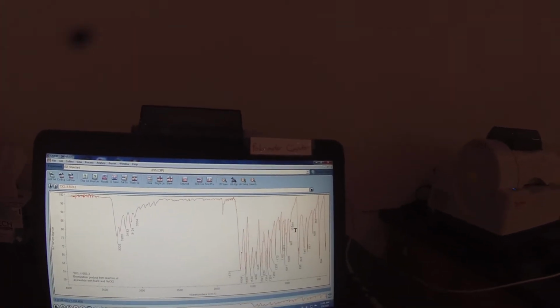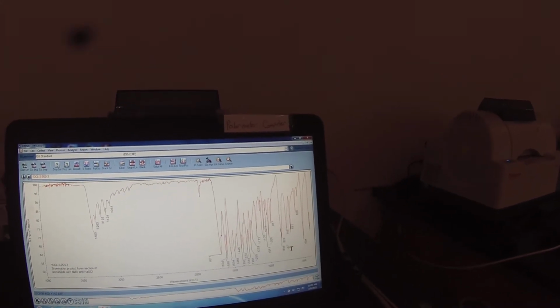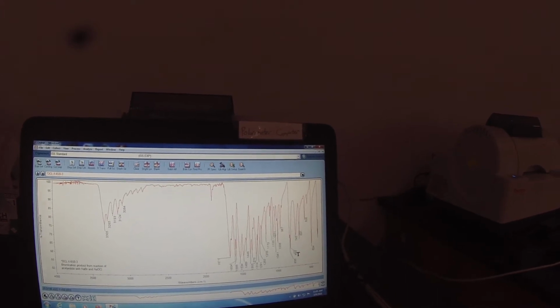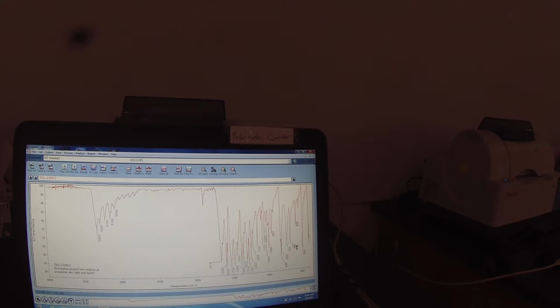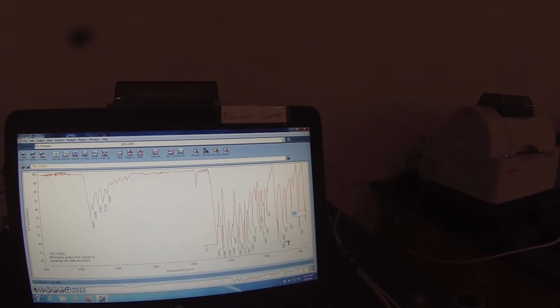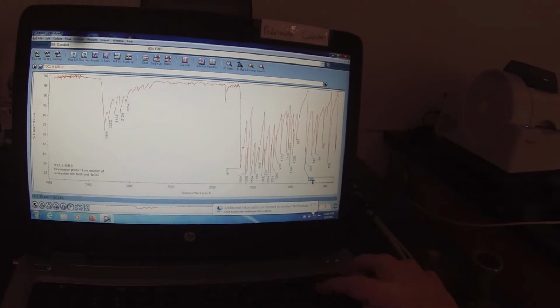This peak at 1115 is probably garbage. It's so small. Same with this peak at 944. I'm going to delete those. And this peak at 565 for the same reason. In this region in here, we should be able to see the 835 peak is just a shoulder, so I'm going to delete it as well.